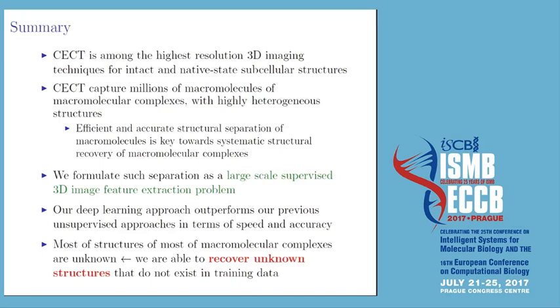Therefore, efficient and accurate structure separation is the key toward systematic structure recovery of these large macromolecular complexes. In this project, we formulate this problem as a large-scale supervised 3D image feature extraction problem, and we developed a deep learning approach which outperforms our previous approaches in terms of speed and accuracy.